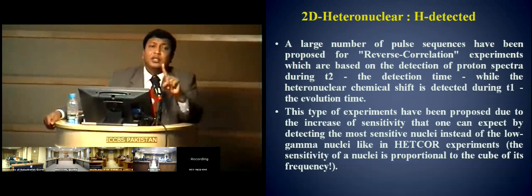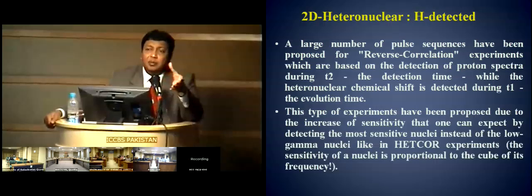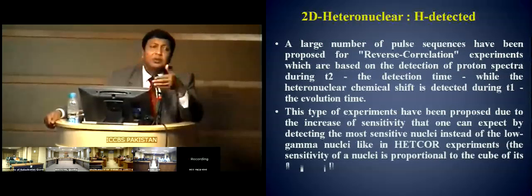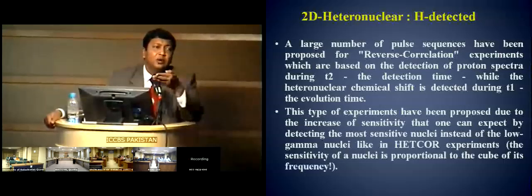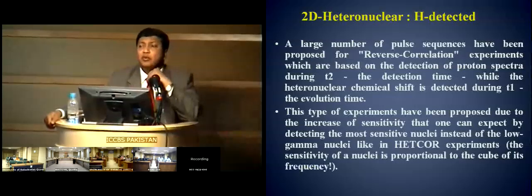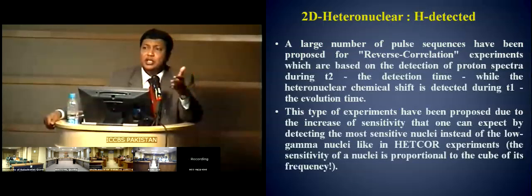When T1 was 0, they had never split. When T1 is large, they have already split. So spin echo would just keep them at the right position, the particular position which has been determined by the T1 time also. Therefore, the protons of a spin system are locked with each other. You brought them to almost the same energy level by giving a train of pulses. As a result, the chemical shift is almost close to each other, but the coupling constant remains operational.